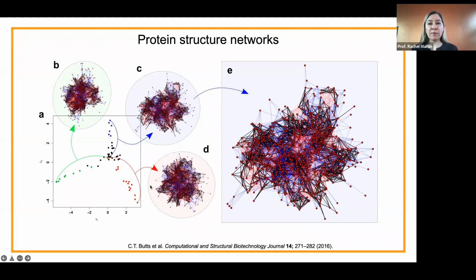And so if you want to make sure that you get the most diverse range of cysteine protease functionality from this data set, what do you do? You make this one and this one and this one. And that is something that we're doing, but I can't tell you how the results are yet because we're not finished.